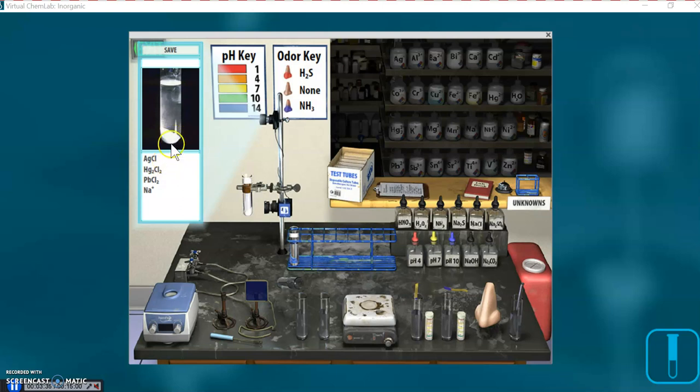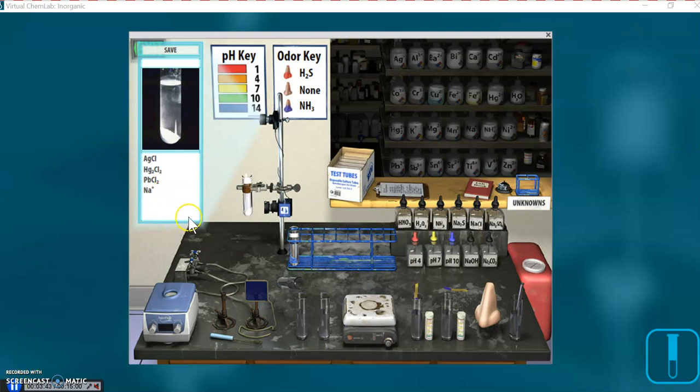We would just see that we had, we formed a white, cloudy solution, and then we centrifuged it, and we have now a precipitate. But we wouldn't know, that could be any precipitate, we wouldn't know which one of these three, or all two, or all three, were actually present in the solution.